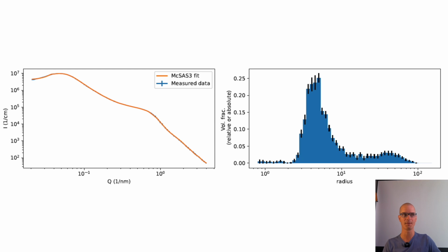It is something that we hope to be able to figure out with this dense composite data set. It's been on my to-do list for the last couple of years. But it's certainly worth exploring. But at least now you know that, if you have dense systems or something, you can still use McSAS and get size distributions out.